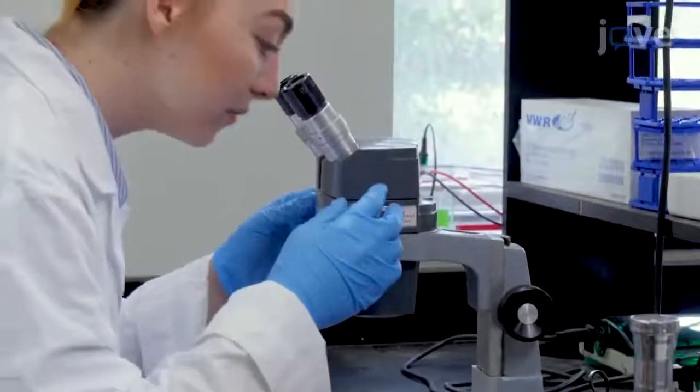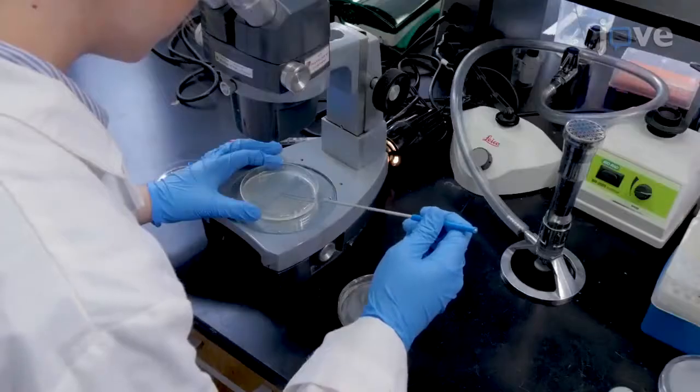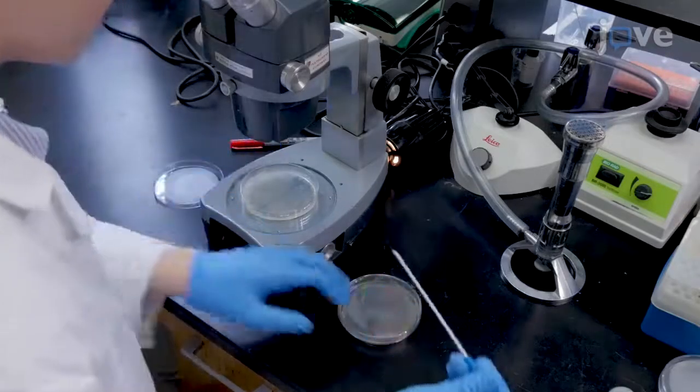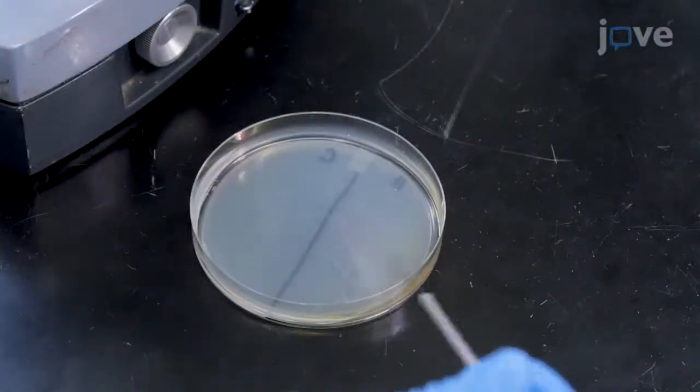The next morning, use a light microscope to carefully select pili negative colonies without dark edges, or pili positive colonies with dark edges from each plate, and streak the picked colonies onto new GCK plates for a 16-18 hour culture at 37 degrees Celsius and 5% carbon dioxide.